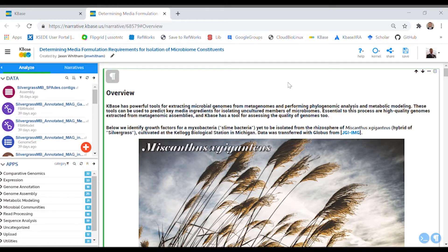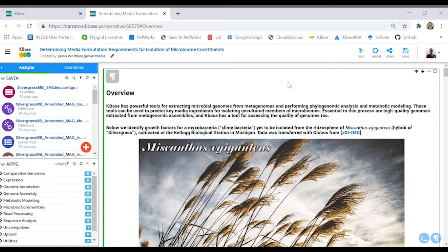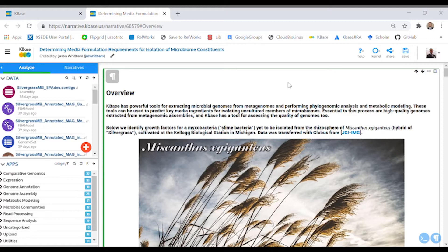This video is part of a series of two short videos. In this video, I'll orient you to the KBase narrative that was created to teach you how to extract microbial genomes from metagenomes, perform phylogenomic analysis, metabolic modeling, and how to predict key media ingredients for isolating uncultured members of microbiomes.